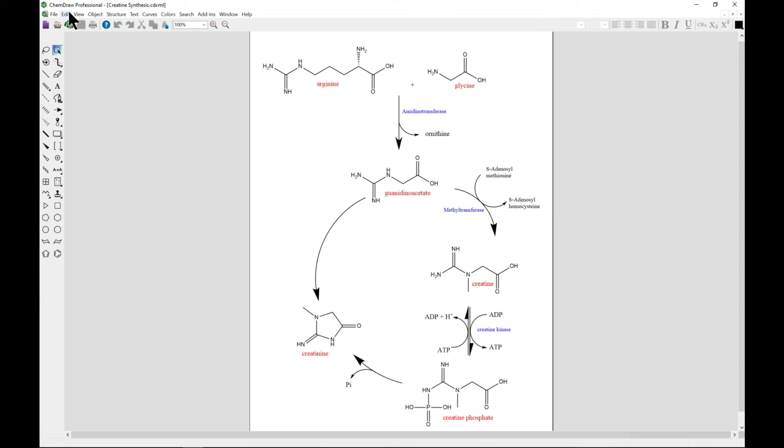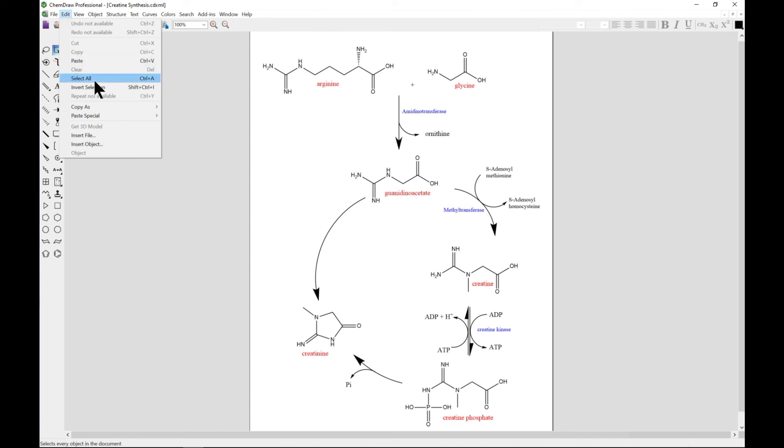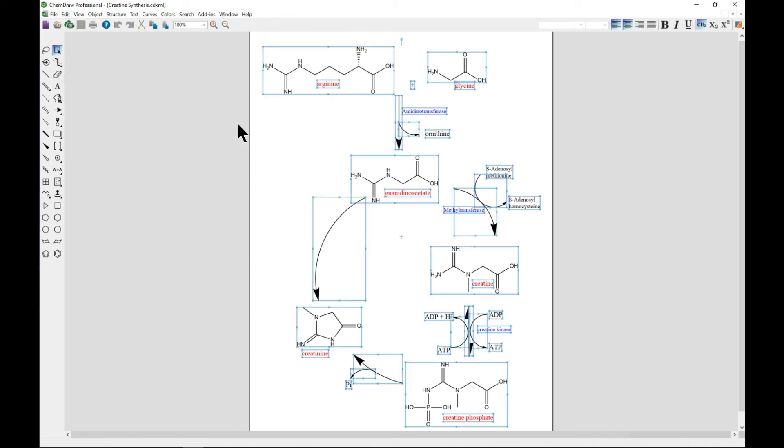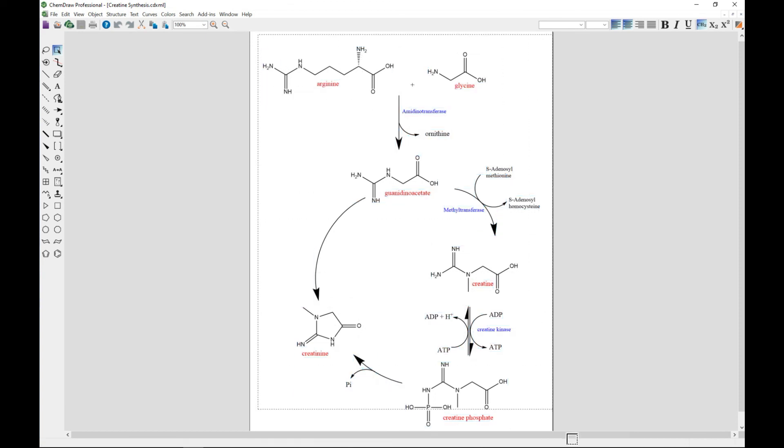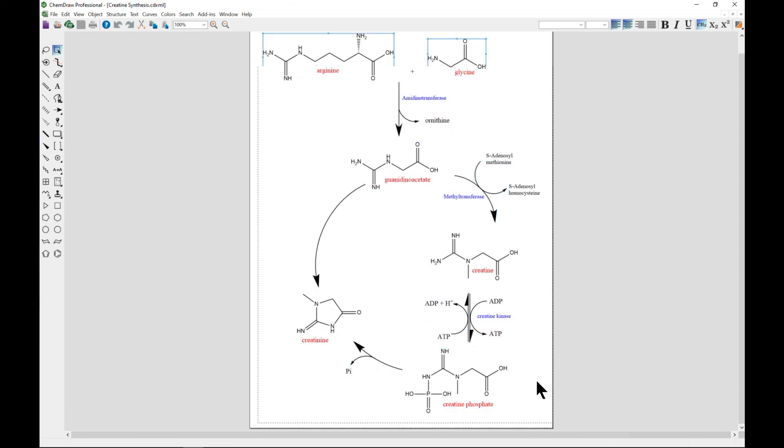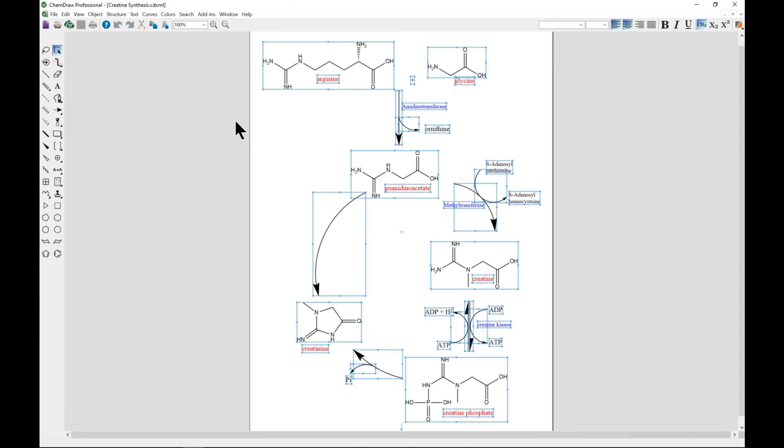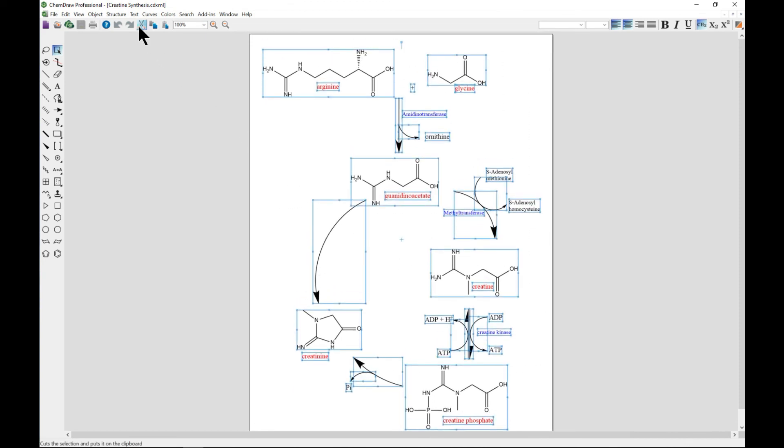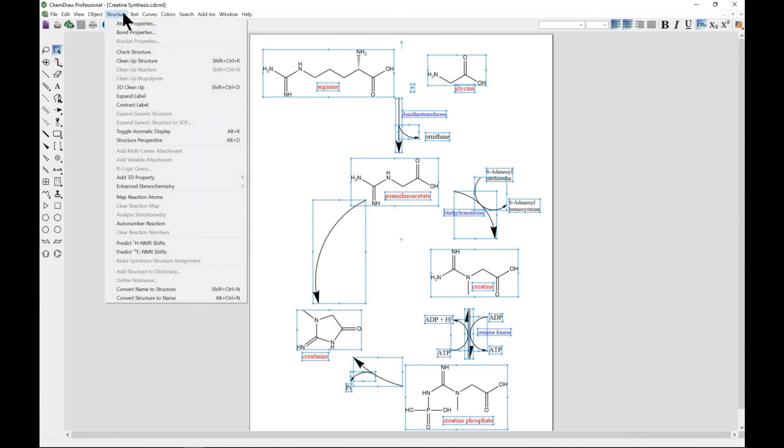It selects everything. Or you can choose this one and drag it all around or whatever you need. Then go to Structure and from Structure, you select Auto Number Reaction.